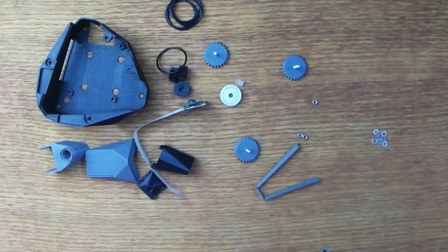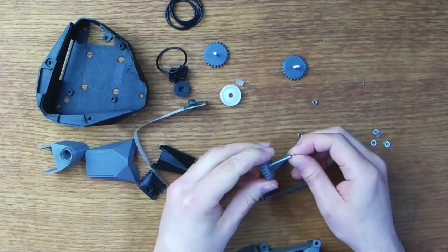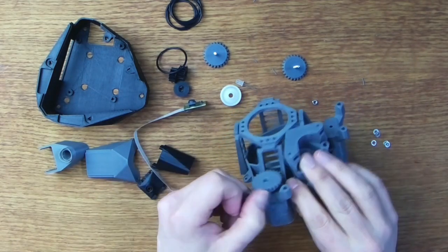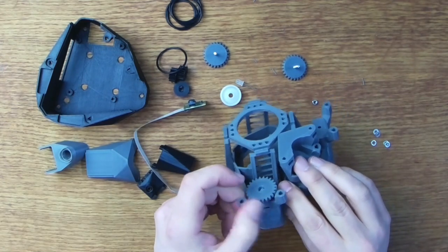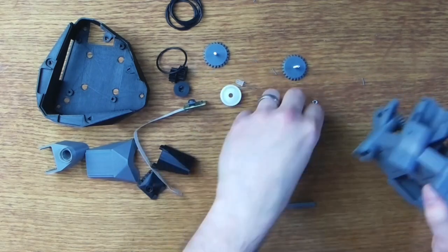These bolts just thread down through a captive nut that's held in a slot just below the label on each axis. The job of these bolts is to push down on the actuator lever points in opposition to the O-rings that pull them up. This keeps the bolts under tension and eliminates any backlash in the movement. Very clever stuff.